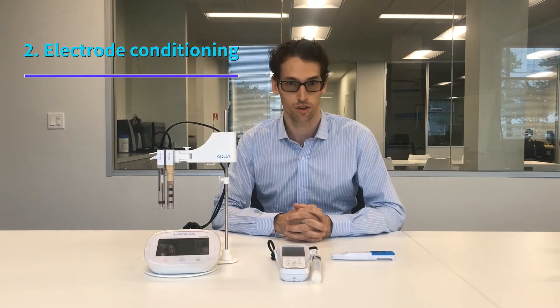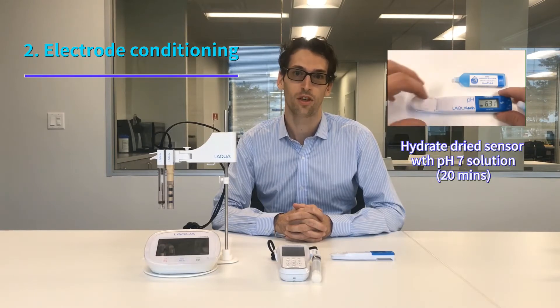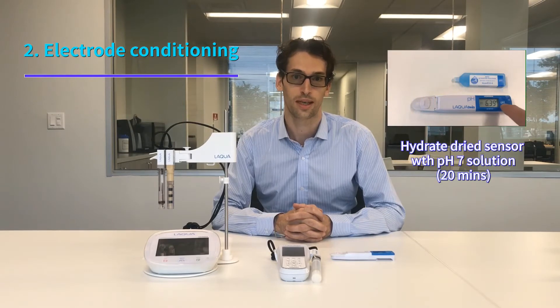The second thing you need to know is that it's important to do an electrode conditioning when the meter has been stored for a long time. In that case the sensor will be dry, and if you calibrate the meter straight after taking it out of the box you can see a drift during calibration or on your first measurement. To avoid this, we recommend putting the pH 7 solution on the sensor for about 20 minutes, and then you can go ahead with the calibration to ensure the most accurate result.